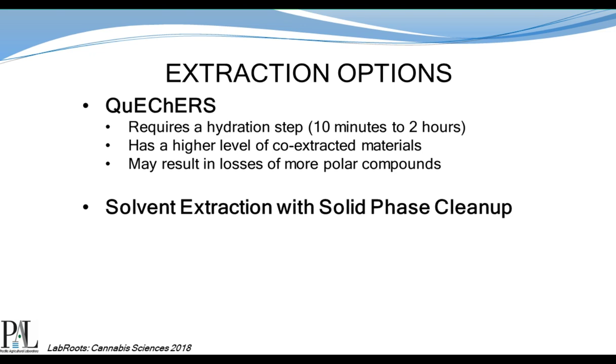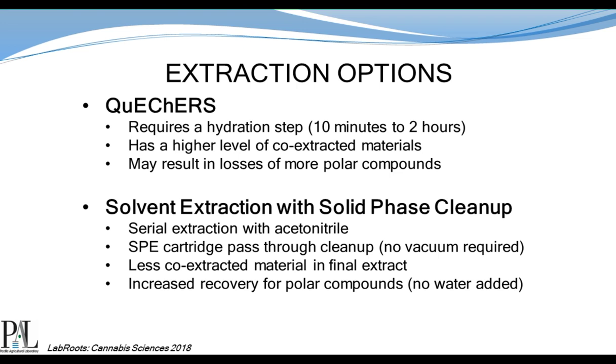Okay, the QuEChERS extraction does require a hydration step because you're typically dealing with a dried plant tissue. This can range anywhere from 10 minutes to 2 hours. It's got a higher level of co-extracted materials, and then you may see some losses in the more polar compounds as a result of this hydration step.